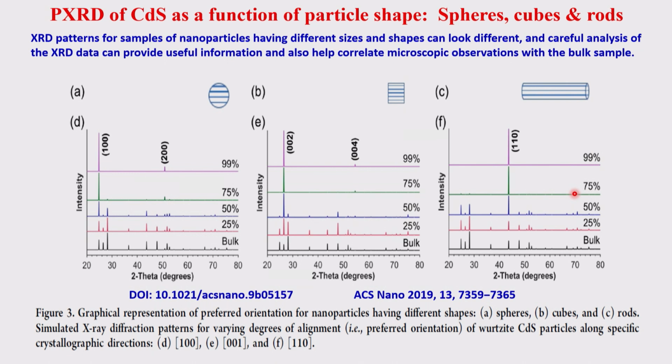You can use them in your sample, you can identify how much of such kind of things are there, and you can also look at their peak widths, etc., and then compare. Now if you analyze this and make a comparison with TEM, then use these parameters in your powder XRD refinement, you will get a good interpretation of your compound, and that's what is basically explained here.